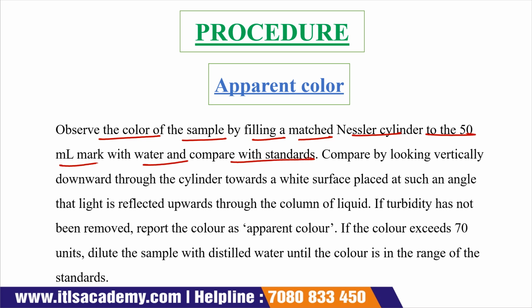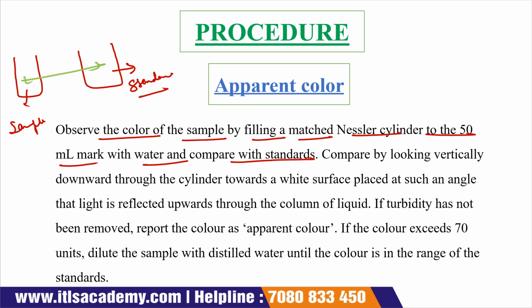What we have to do: we take two Nessler cylinders. In the first cylinder, we have a sample. Okay, and in the second Nessler cylinder, there is a standard. Now, what we have to do, we compare both. Comparison.